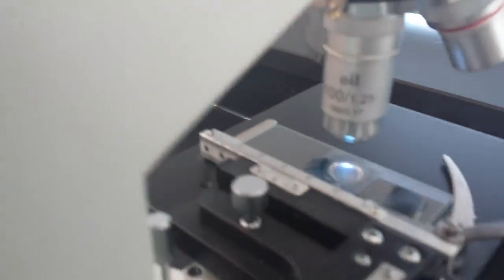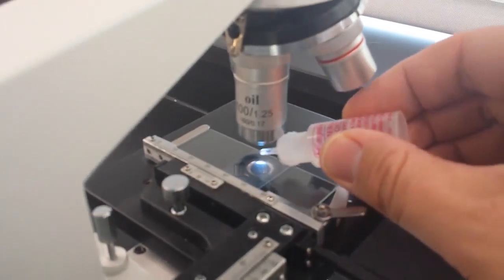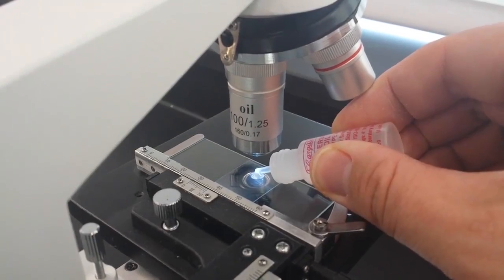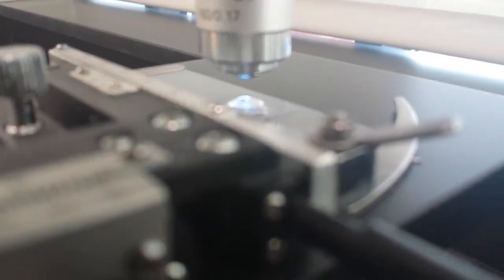Lock it into place, and I'm going to use a little bit of that immersion oil. Put a little drop right here, and then all I have to do is I lower down the objective until it makes contact with the immersion oil, just like that.